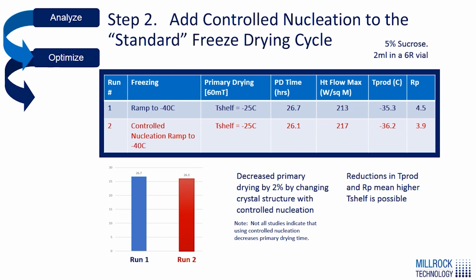In a lab or production clean room environment, we can see typically -10, -15, or even up to -20 degrees of supercooling before autonucleation. And when they nucleate at such a low temperature, it leads to rapid, very small crystal formation and a higher cake resistance. So we didn't see a huge reduction in primary drying time between here because we were already nucleating at a relatively high temperature of -3 to -5 degrees C.